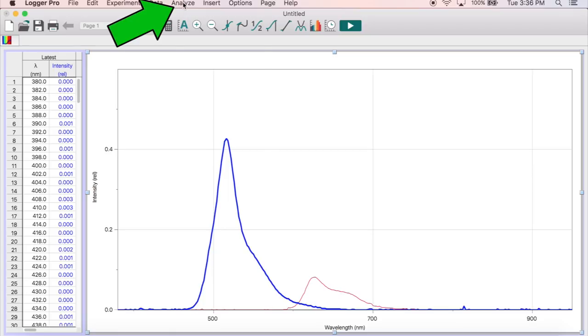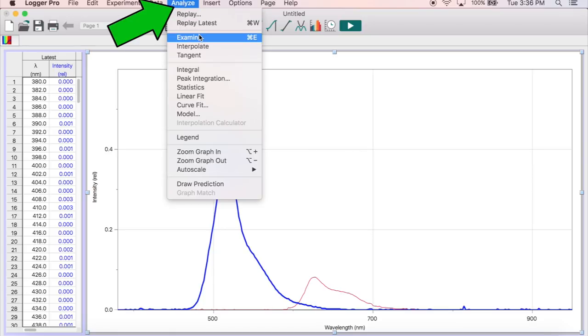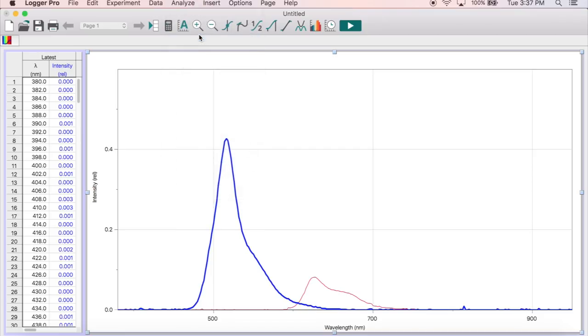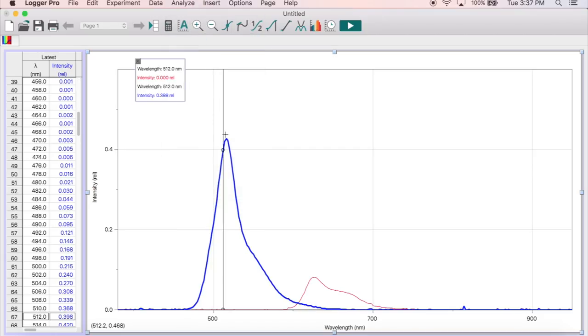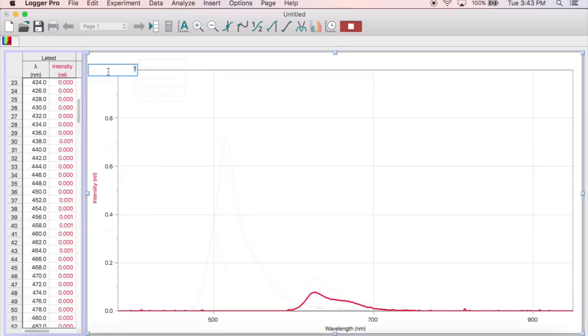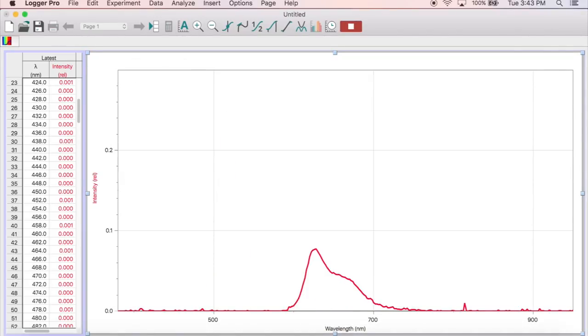To highlight a specific wavelength, click the Analyze tab at the top of the screen and select Examine from the drop-down menu. You can then move your cursor to your peak of interest. You may also need to adjust the intensity axis by clicking the uppermost y-value on the left part of the screen and entering a smaller value.